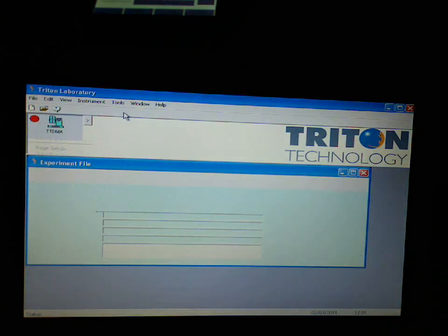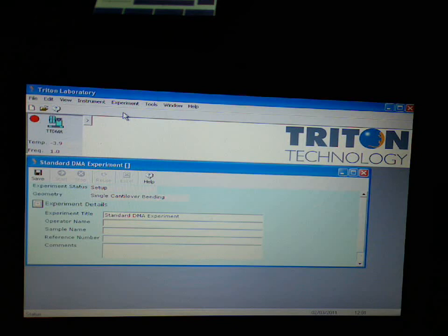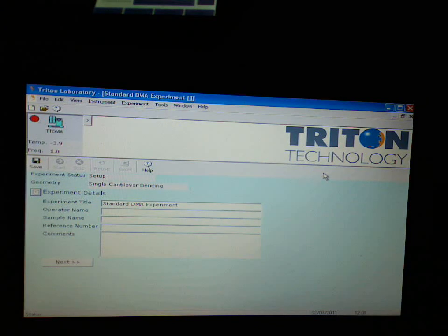It's now going to open up the worksheet. I'll let that open up. This is actually being run on a netbook, which is a very weak PC, so a little slow, but it will show quite clearly that there's no problem running the instrument in this format. If I just bring that up to a full screen, we can see a bit clearer.